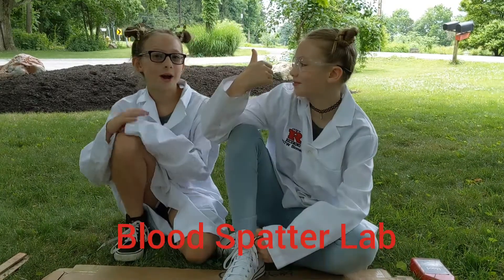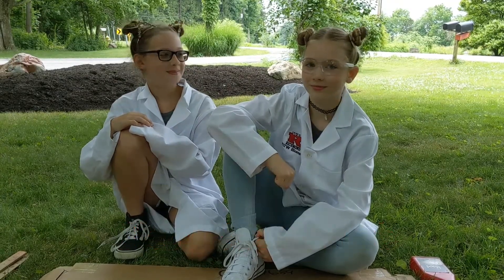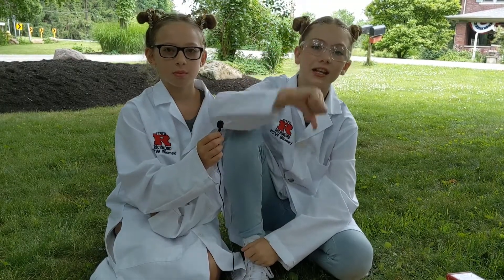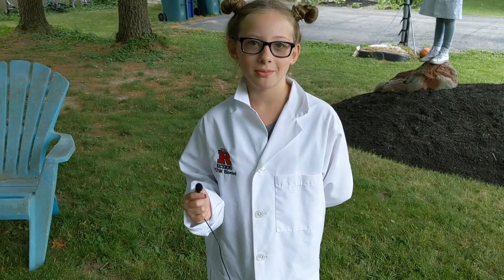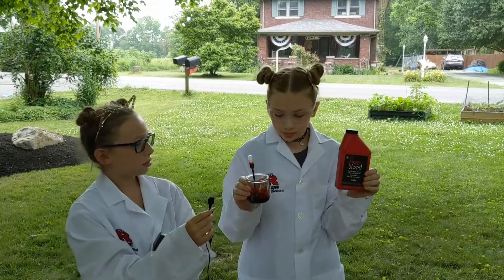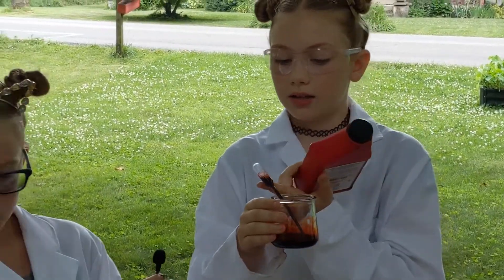My name's Lily Hittrick. My name's Taylor. We're here to do some blood spatter. We're going to tell you about our PPE: we have safety glasses, a lab coat, and toe-covered shoes. We tape down the paper so it won't blow away. We use vampire blood for blood spatter, and we use a container and a pipette.